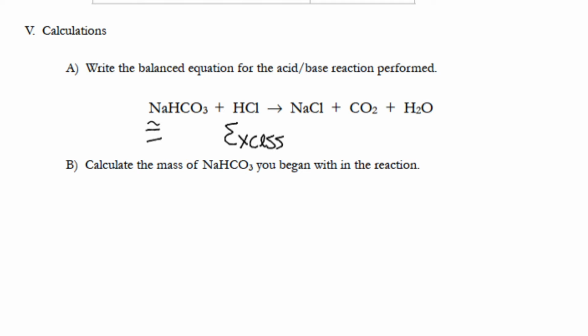Then, guys, your limiting reactant will be the sodium bicarbonate. And you will be getting approximately a gram of sodium bicarbonate. But guys, understand, as you know in lab, it's not good enough to be close. So we're going to figure out what the mass of the sodium bicarbonate actually is. You should understand that we're going to do that through mass by difference. We are going to use about a gram of sodium bicarbonate. That is at the balances at the back of the room. There's a small vial of sodium bicarbonate.